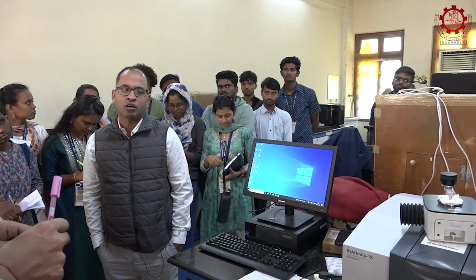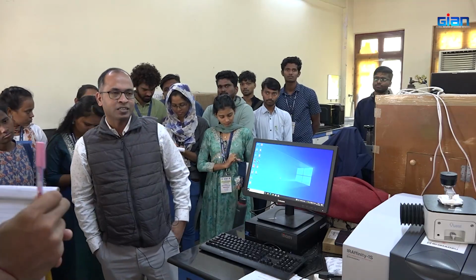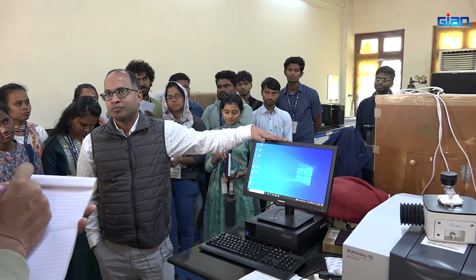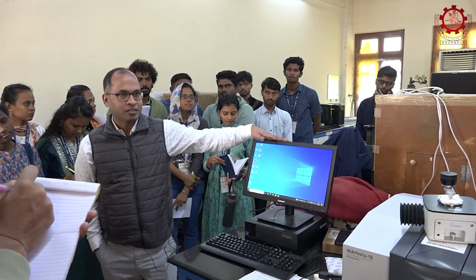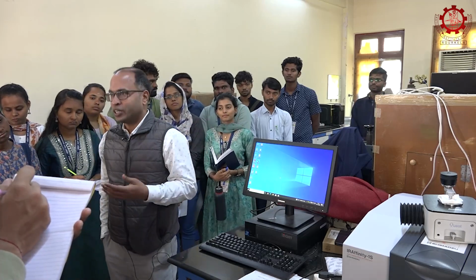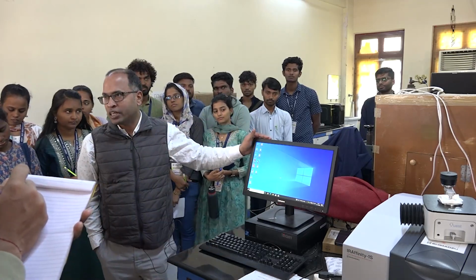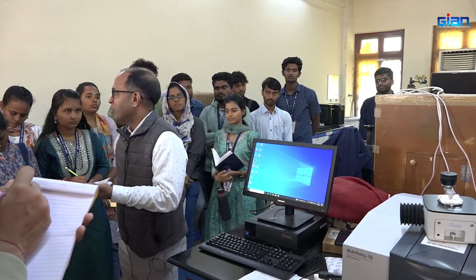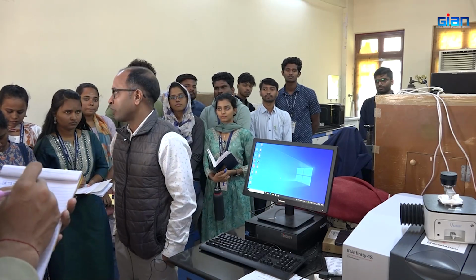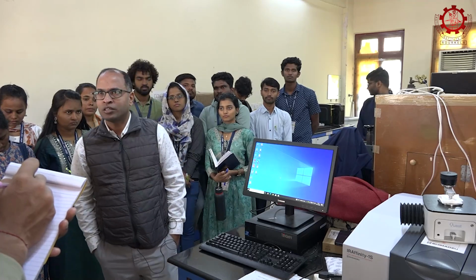We do research on those topics, and we use this FTIR every day because our characterization of molecules is based on this. And one more equipment you will be learning is nuclear magnetic resonance. Okay, I think that is on 27th.